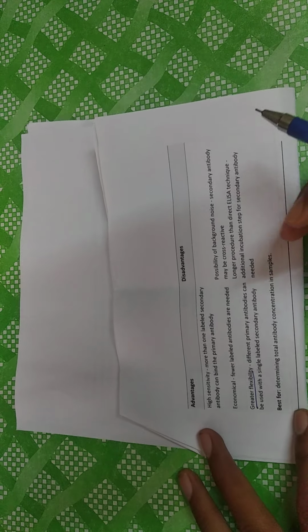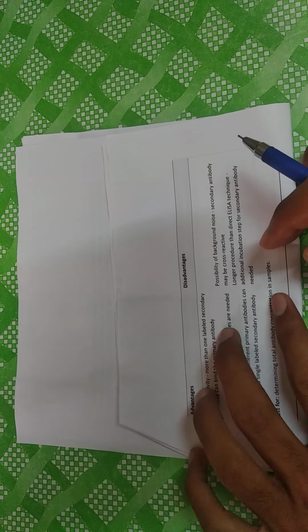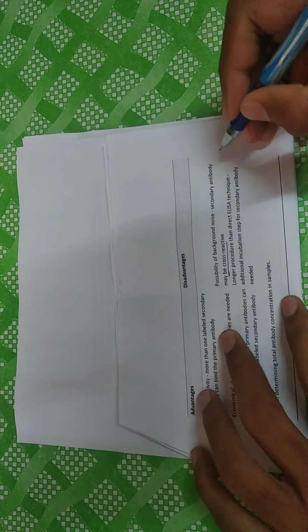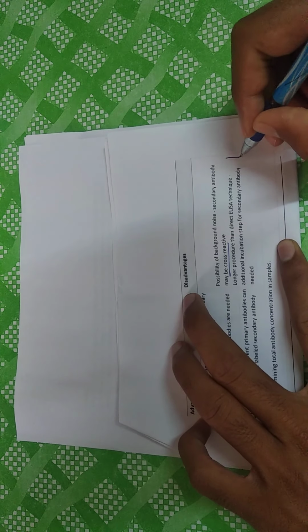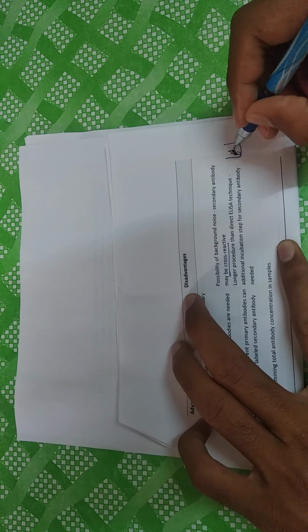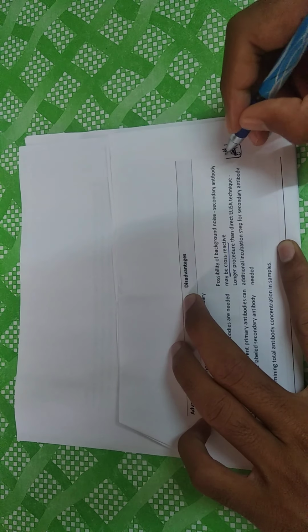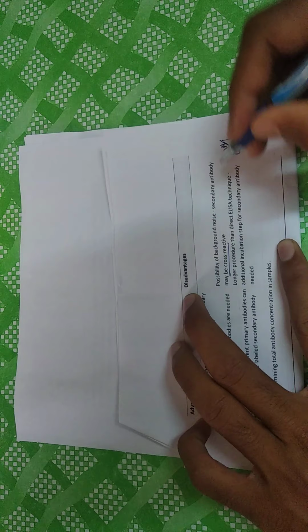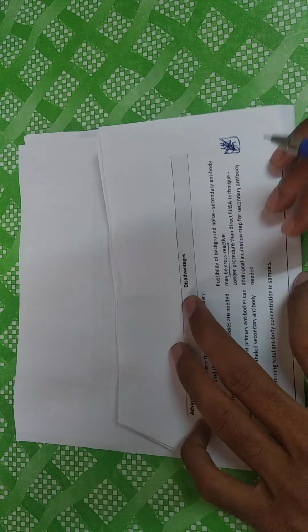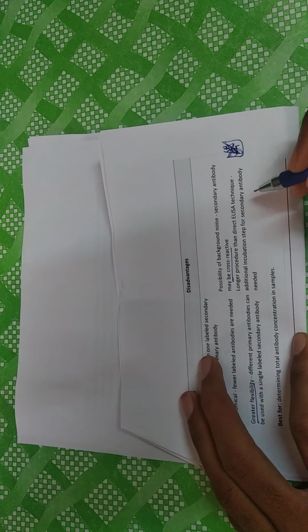The main disadvantages are the possibility of background noise. The secondary antibody may be cross-reactive. That is, the first antibody is attached, and after the second one attaches, a cross-reaction may take place. Cross-reactivity may take place, and it takes a longer procedure than the direct ELISA technique.